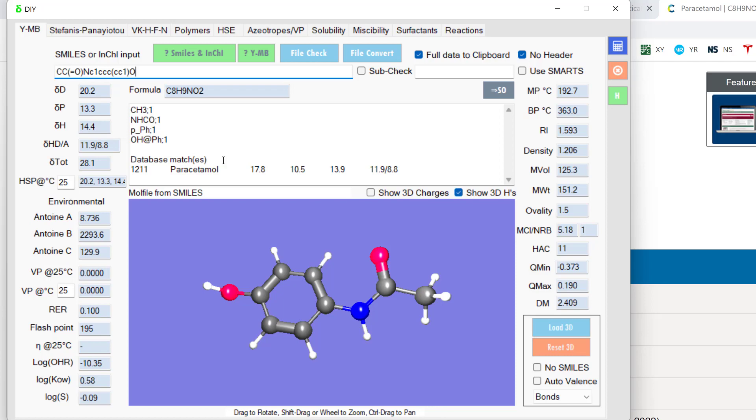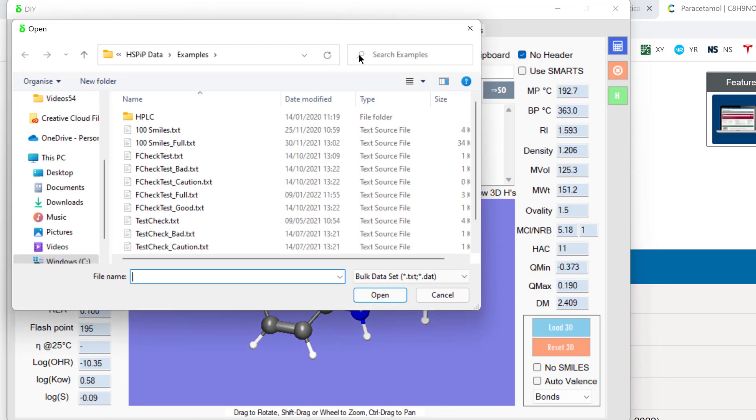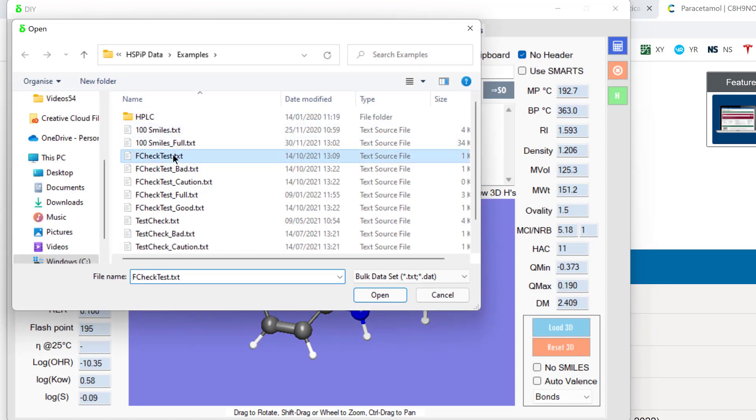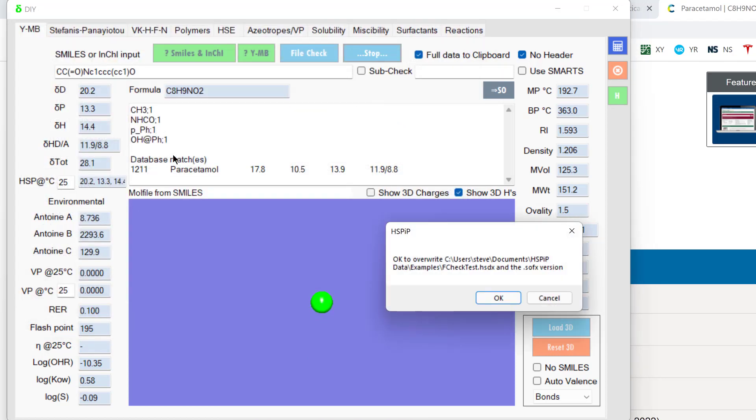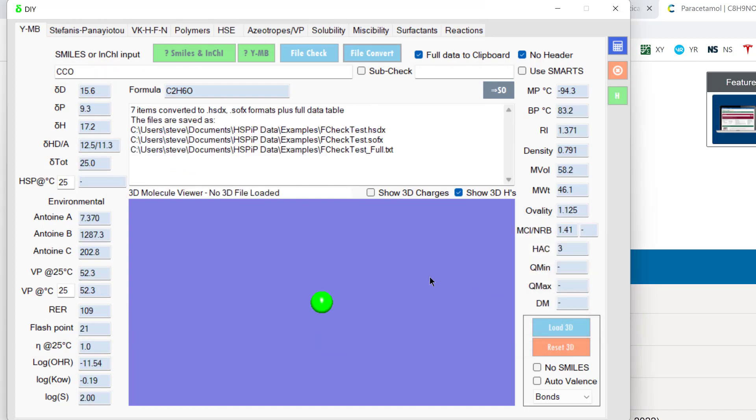We can do all these things one by one, but suppose we have a whole list of compounds. We put them into a file with the name and the SMILES tab separated and we load that file. In this case, FCheckTest, why not? And it, in this case, went through seven items and converted them to the HSDX format.